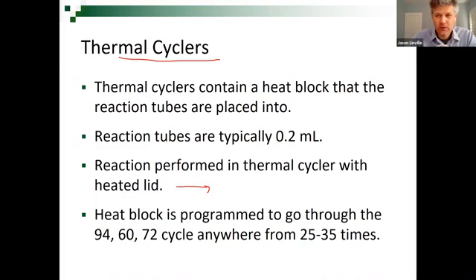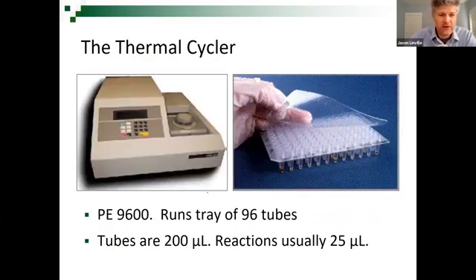And that's like evaporating all of the water out of your reaction. Now all of your components are too concentrated in what's remaining at the bottom of the tube. So that lid is heated, it keeps that condensation from forming. Some of your liquid will go into vapor form, but it keeps everything at the bottom of the tube. Helps with the efficiency of the reaction.